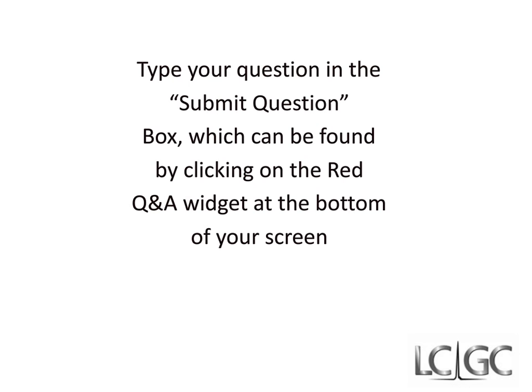Well, it depends. I think what you have now with mass spec, and depending on what type you have, when you choose your transitions, you'll have a quant ion and then you'll have a qualifier ion. If those transitions are different enough, then chromatography, I don't want to say becomes less important, but if that transition is different, the instrument itself and your parameters that you set up in your acquisition, which again are your dwell times or your scan times, can actually still give you very good peaks.